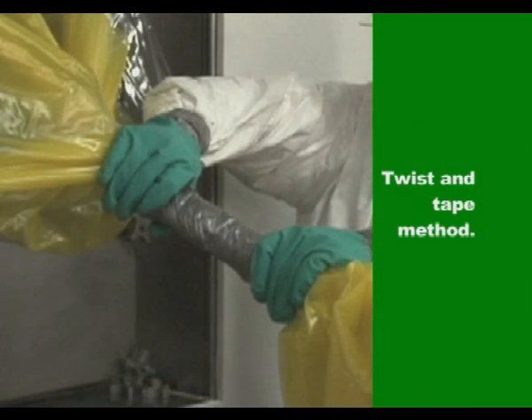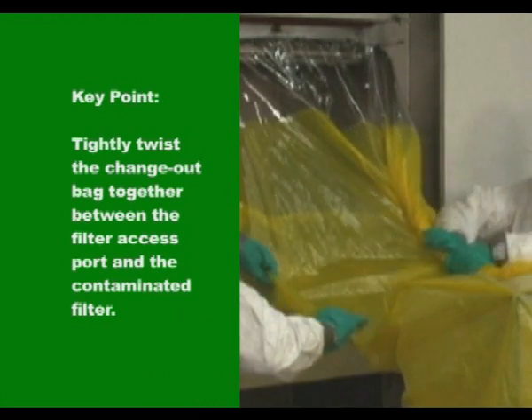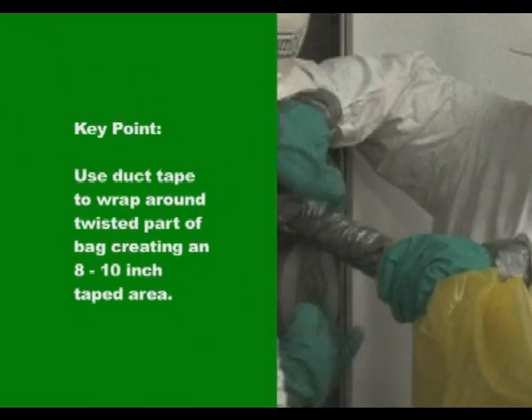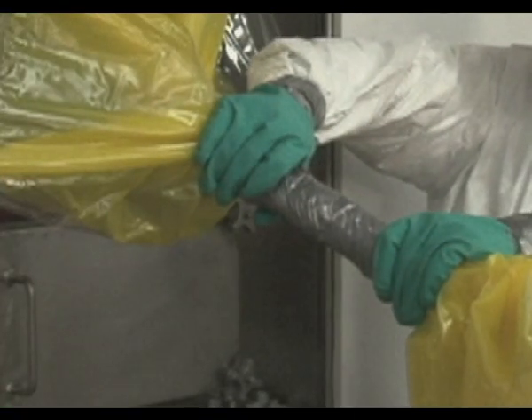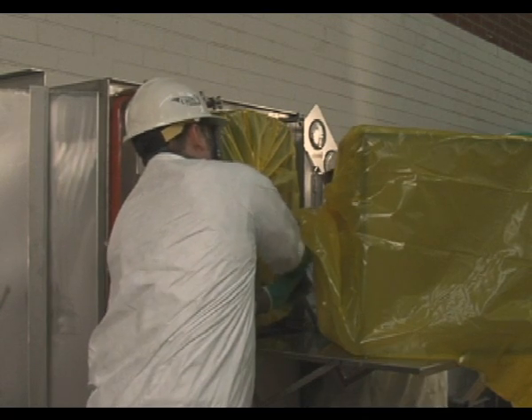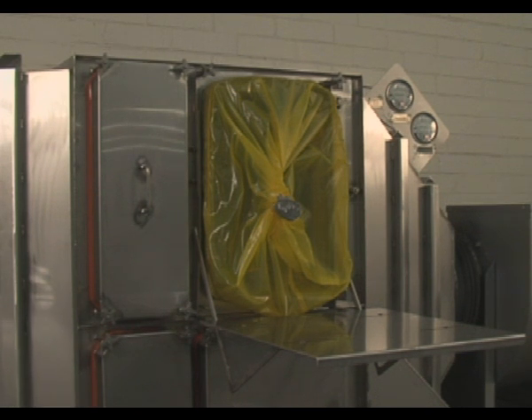An alternate method is the twist and tape method. Tightly twist the change out bag together between the filter access port and the contaminated filter. Use duct tape to wrap around the twisted section of the change out bag, taping approximately 8 to 10 inches of the bag as tightly as possible. Cut completely through the change out bag in the middle of this section, leaving a stub bag on the bagging ring of the housing. Tape over the exposed edges where the bag was cut. Remove the contaminated filter in the bag for disposal.